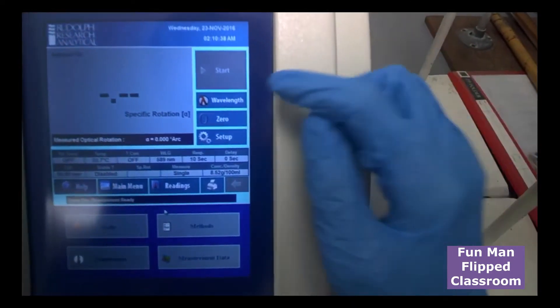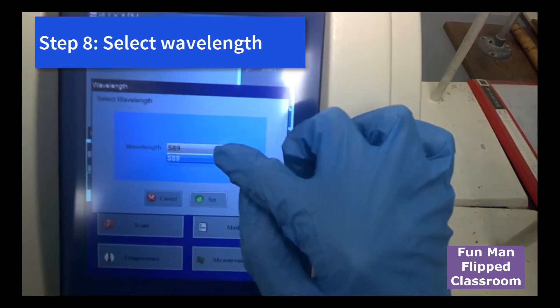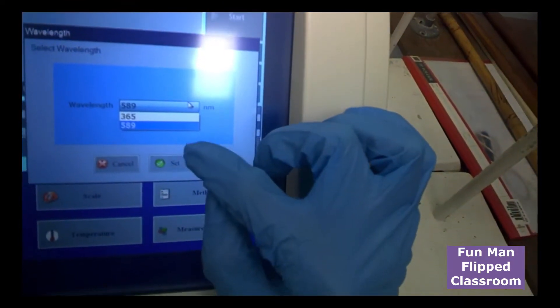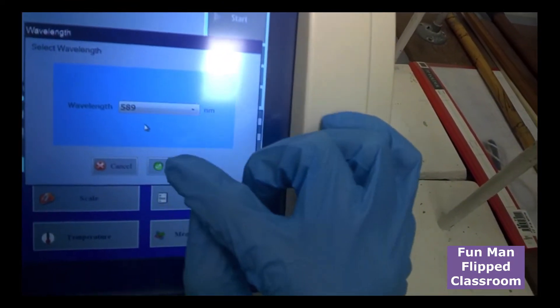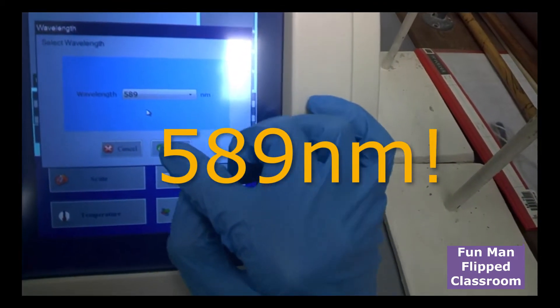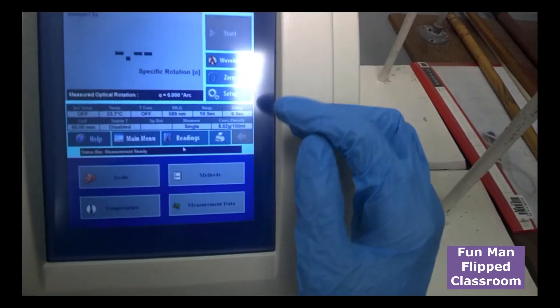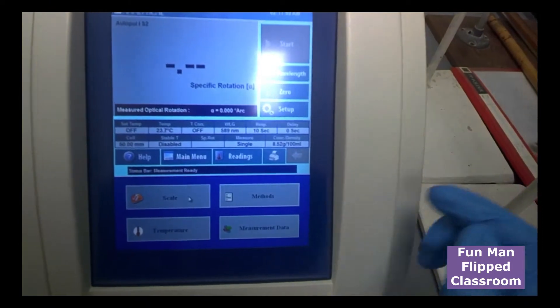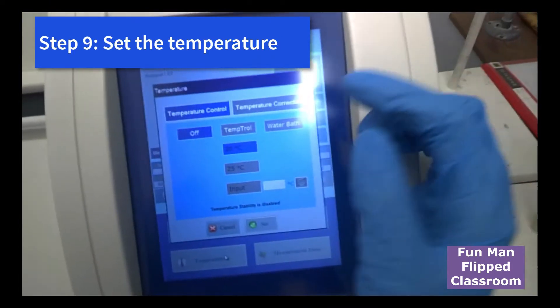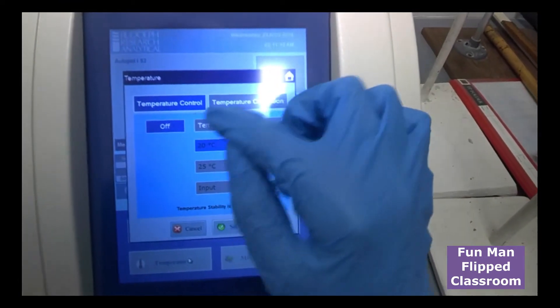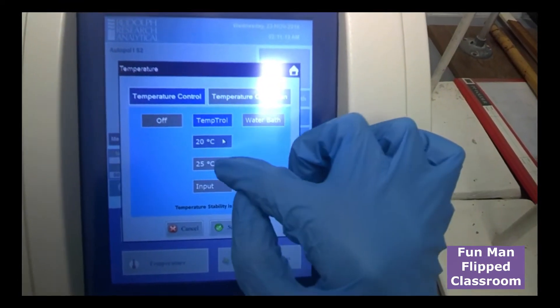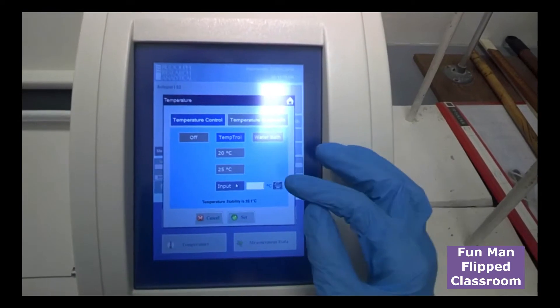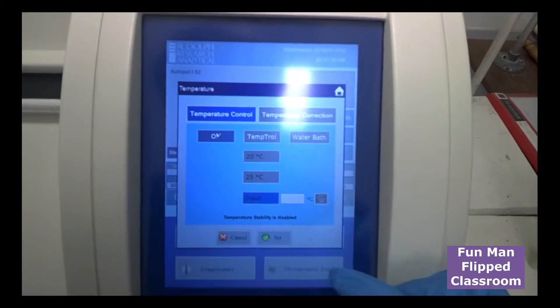Now the thing is, there's a few things we can do here. Wavelength. We can adjust to two kinds of wavelengths for this machine. Either 365 nanometers or 589 nanometers. So here in this case, we are using 589 nanometers. We set it. And if you want to, you can also set your own method. Different kinds of methods. So we have one that's being saved here. But for now, we don't have to touch this. Temperature. We can also set whatever temperature we would like to scan. For now, it is off. If you would like to use temperature control, we can set 20 or 25 or a selected temperature here. So the machine is going to warm up to that temperature before it will scan. So back to normal. And I will set it.